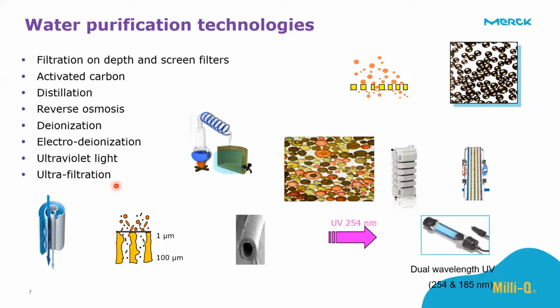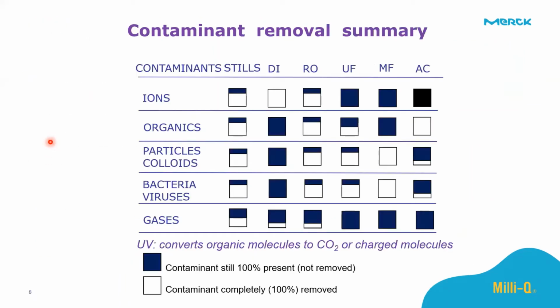We also have ultrafiltration as well. So these are the purification technologies around, and I want us to look at their effect on the contaminants.